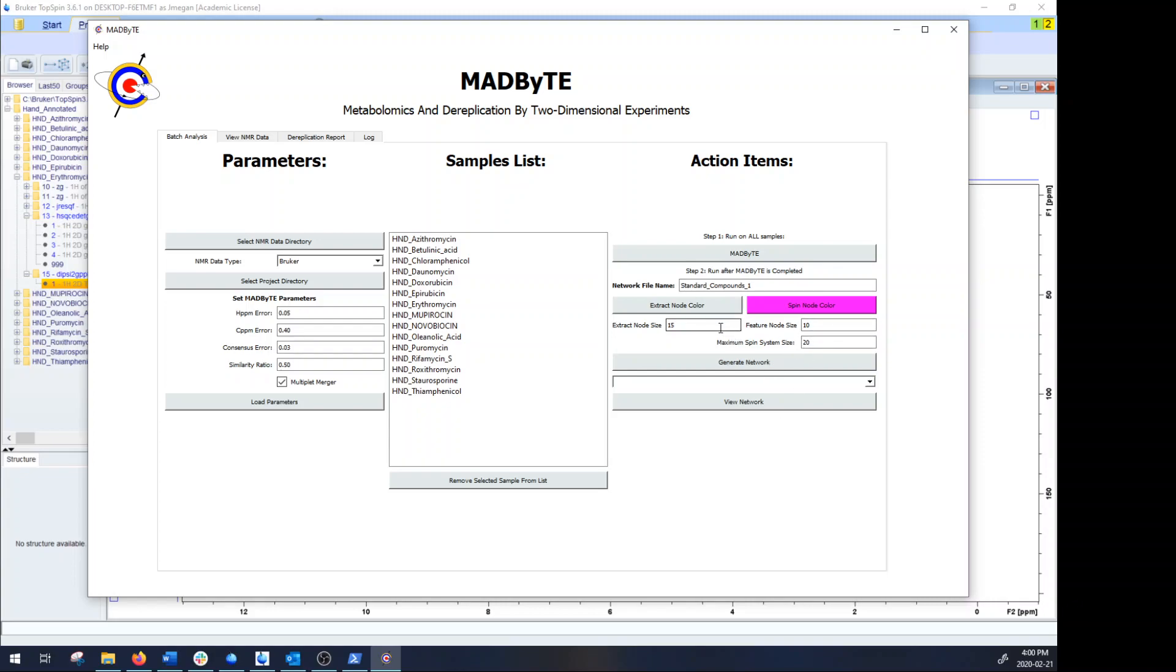And as well I can also adjust the extract node sizes and the feature node sizes, as well as the maximum number of spin system members that I would like to see. So what happens is sometimes in the metabolomics data you'll have a very congested part of your 2D NMR spectra which actually ends up generating this massive correlation network of 40 or 50 different members and that's not usable data. Now there may be a couple underlying spin systems that are of interest, but you're not going to actually use those for any meaningful purpose.